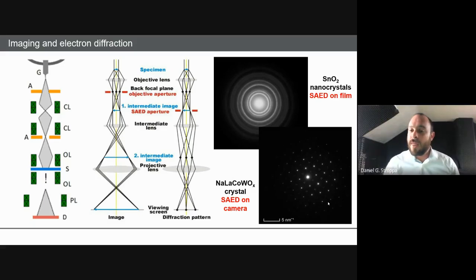So the way that you distinguish between a monocrystal and a polycrystalline material, of course, within the area that you're illuminating, is if you have a spot pattern that is related to the spaces and angles of a certain viewing of a crystal, this is going to indicate a single crystalline domain. And then if you start to see points that are not directly correlated, so for instance, they are not linear combinations of two other points, then you start guessing that you have more than one crystalline domain. And of course, if you start adding up a lot of them, you're going to fill in the circle, and then you only have the distances. Does it make sense to you?